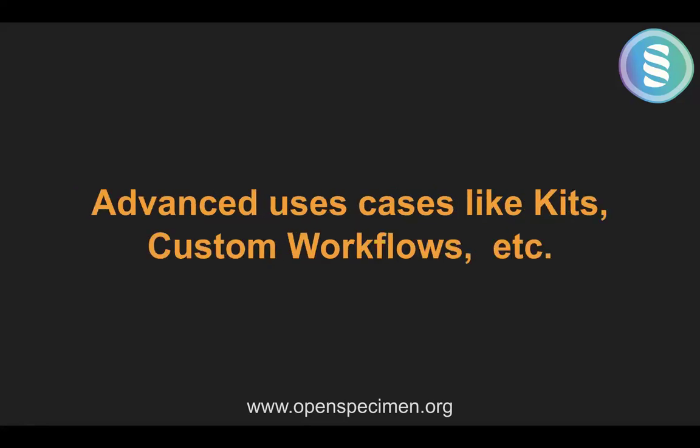One of the bigger groups was managing clinical trials and the specimen collections for trials. They create collection kits, send out kits in advance, and all those things. So they use OpenSpecimen now to manage their whole kit management, right from creating the kits in OpenSpecimen, sending out the kits to the sites, collecting the kits from the sites, etc. And there's a module in OpenSpecimen that I'll show later called Workflows, which is meant for developing custom workflows based on specific use cases.